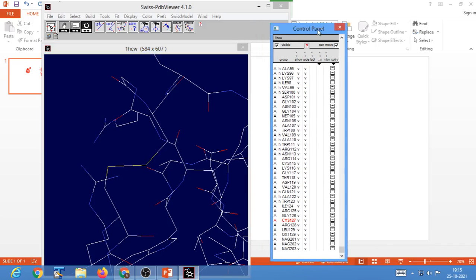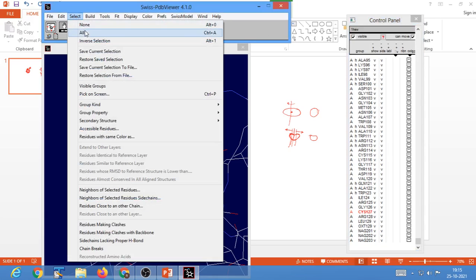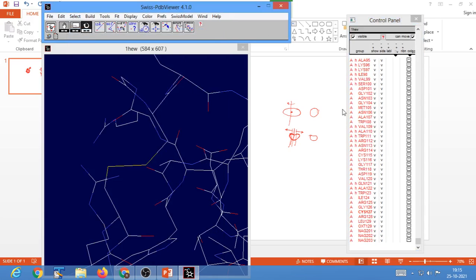Now let us select all, so that everything is selected.